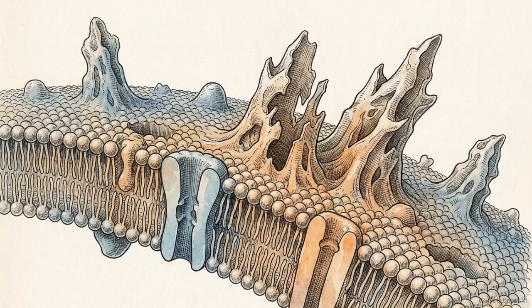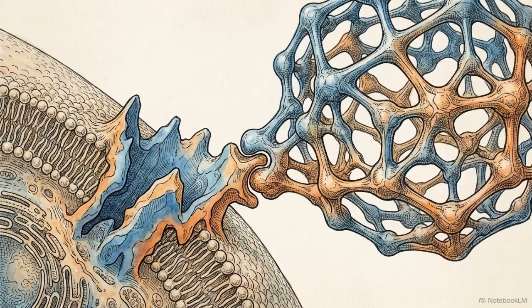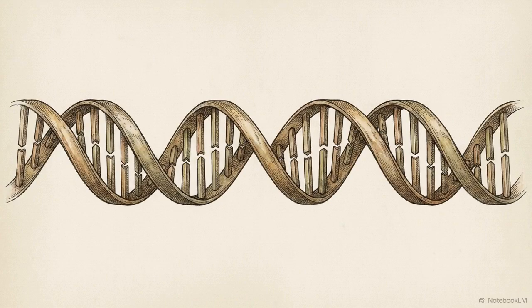In clinical oncology, identifying the exact somatic variant, a genetic mutation unique to a patient's tumor, determines which precision drugs will be effective. This specific biological signature dictates the entire treatment strategy. But sequencing machines cannot read a human genome linearly from start to finish.